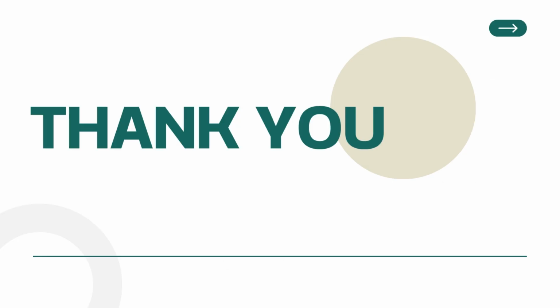Congratulations! You now understand the complete process of laboratory waste management at MFU. Remember, sorting, labeling, recording, and safe handling are key to protecting ourselves and the environment. Thank you for learning with us, and stay safe in the lab.